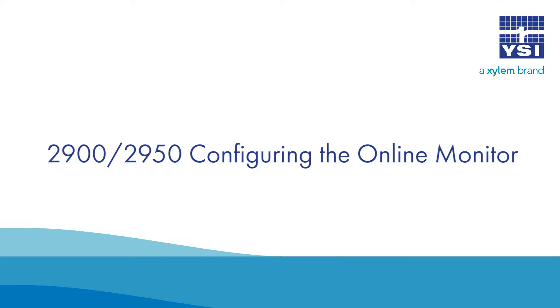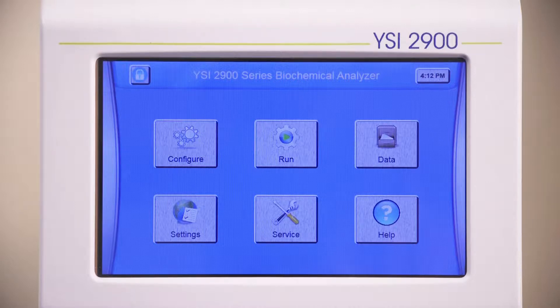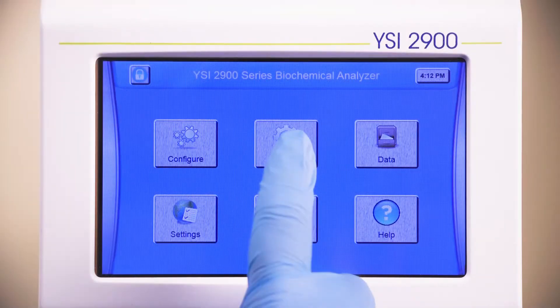Configuring your Online Monitor and Control Session. Configure the instrument with the necessary membranes, reagents, and buffer as described in the other YSI videos. Calibrate the instrument and then from the main screen, press Run.